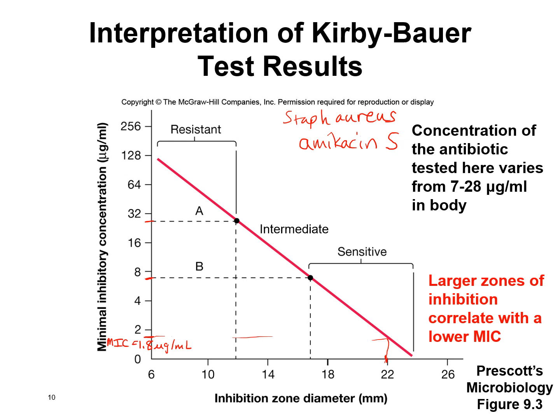But let's say that maybe we had another antibiotic that we were looking at. Maybe we had some penicillin. And maybe for this one, when we measured that zone of inhibition, let's say here's our antibiotic disc, and maybe when we measured that zone, it was only 8 millimeters. Okay. And they actually have tables for this instead of a graph that you can just quickly look at to tell this, but you would have a different graph for each antibiotic.